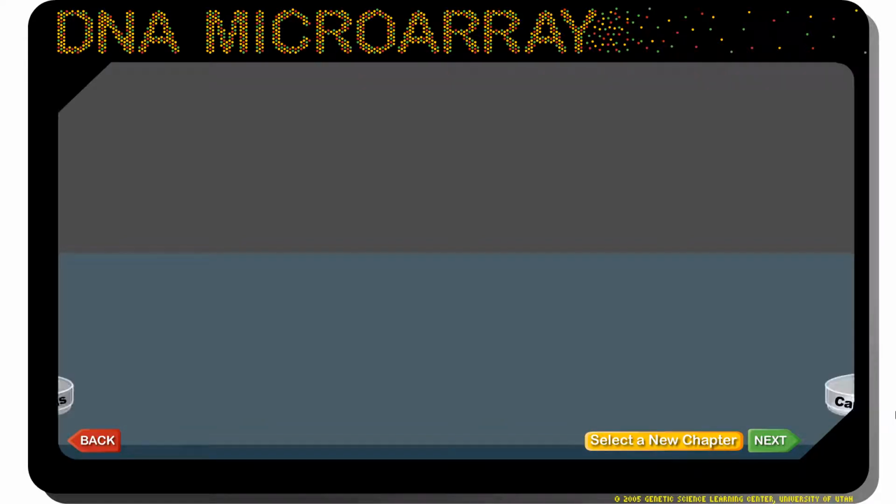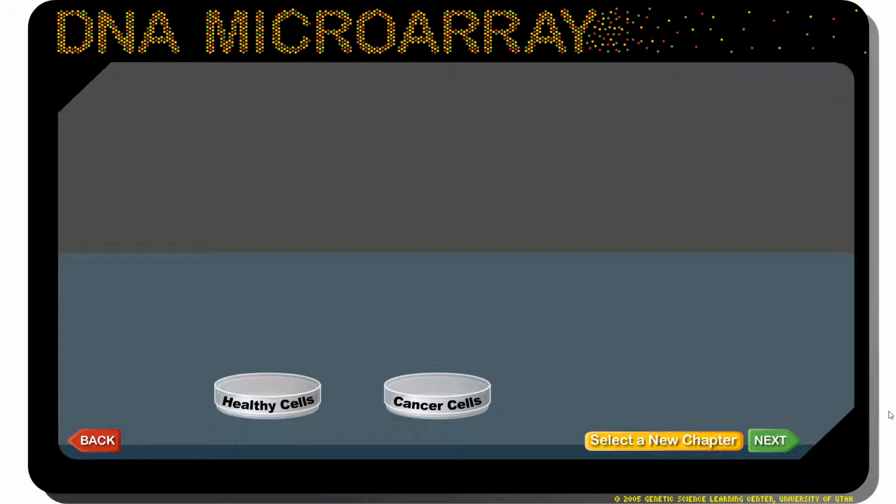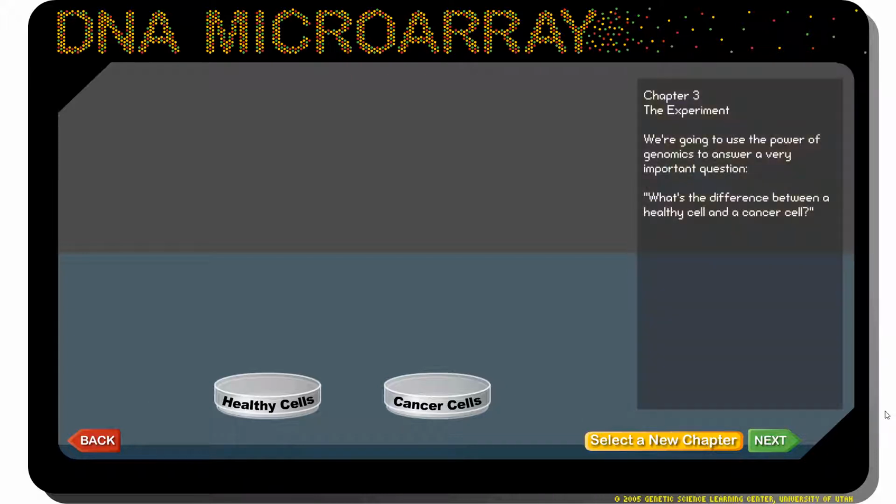In theory, both can look the same, but since cancer cells undergo unregulated cell division, it must have genes that are turned on when these genes are supposed to be turned off in normal cells. Now, once we know which of these genes are turned on, we can easily detect cancer in a tissue sample using a microarray. So let's go and check if our initial assumptions are correct.